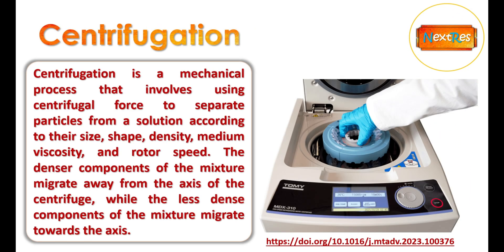Coming to the first one, centrifugation is the most common technique and every lab generally has this instrument. In centrifugation, the larger molecules and aggregates settle down due to the rotor speed, while the smaller species — the quantum dots — separate out in the solution.